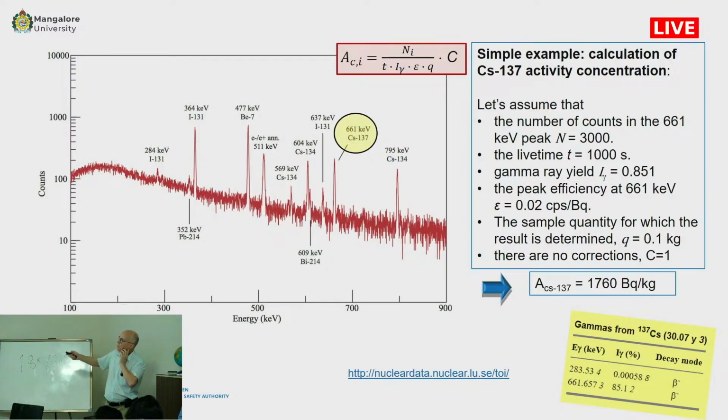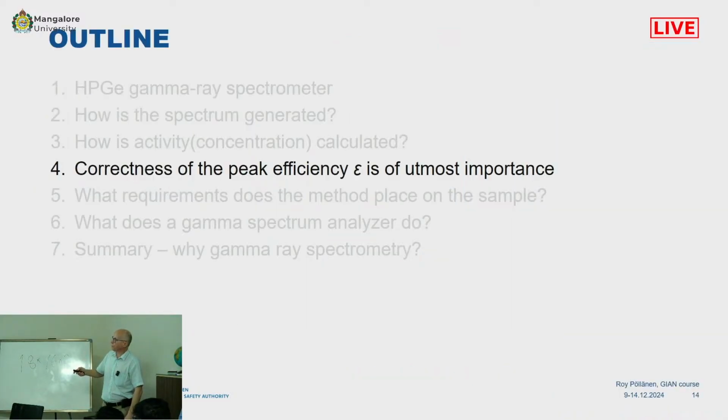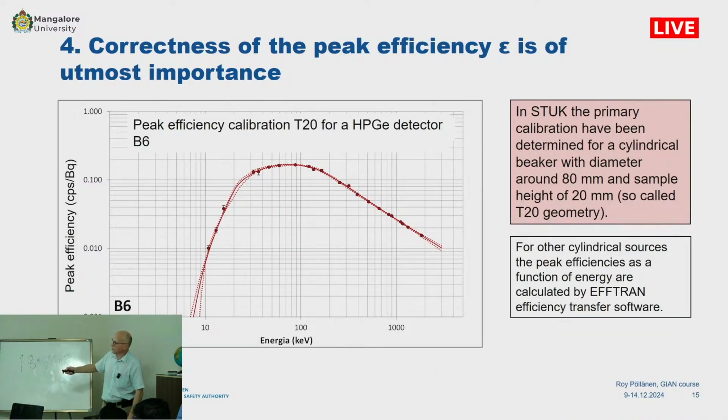So you do not need to know the efficiency. The program should take the efficiency automatically into account. However, we should have the correct curve for the sample in question.